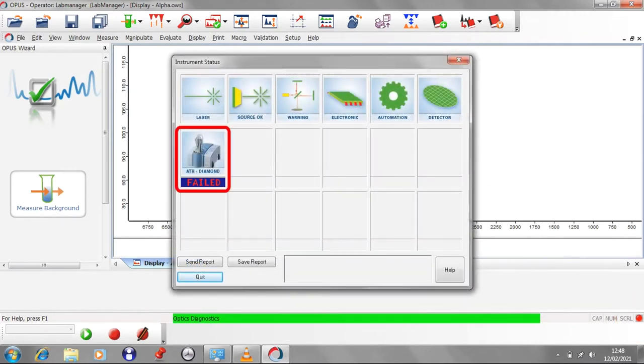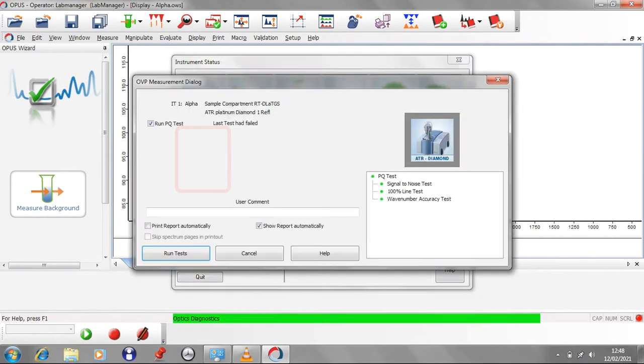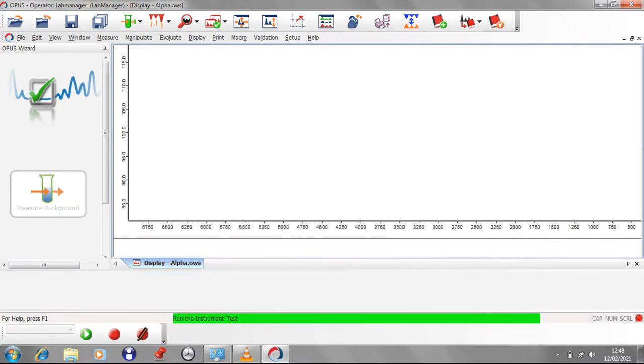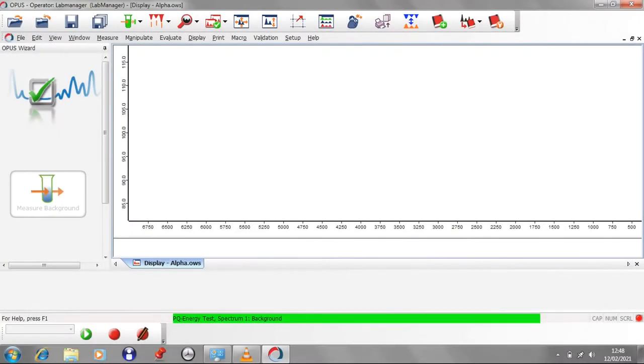If any of the instruments say failed or expired, double-click on the box describing the test to run the specific test which will correct the previous fault. The results of the second test should be success, which will be displayed in a PDF popup as shown here.